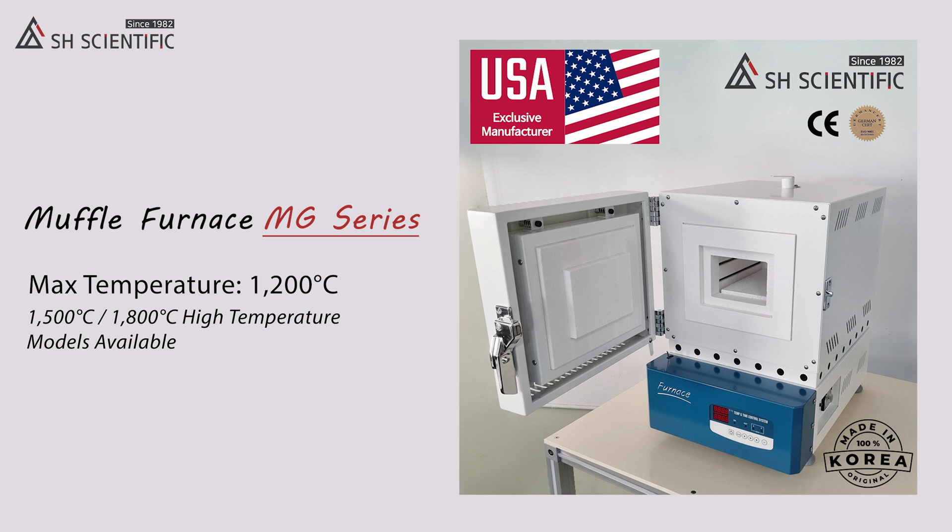It comes in four sizes: 3, 5, 14, or 27 liters. All four sizes have the same digital controller with temperature stability of plus or minus 1 degree Celsius.